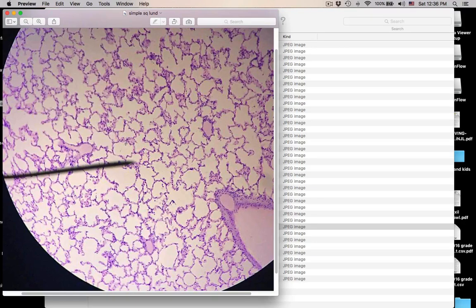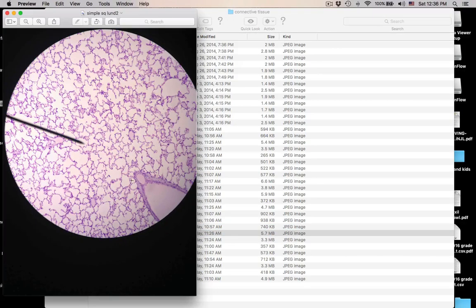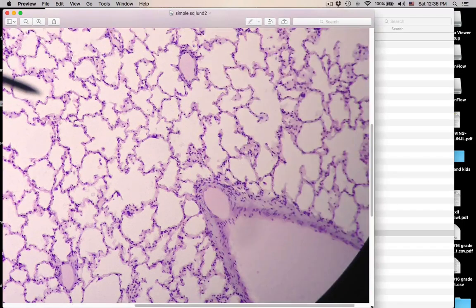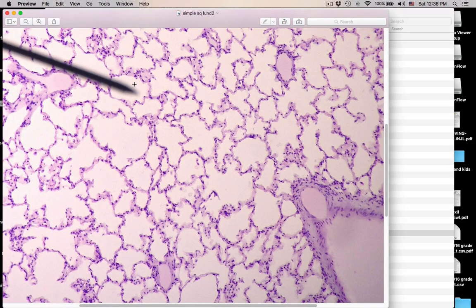When you see this, what organ is this from? This is the lung — nothing else looks like this. All these are little alveoli where gas exchange takes place. This is all simple squamous. Simple squamous lines the alveoli of the lungs.